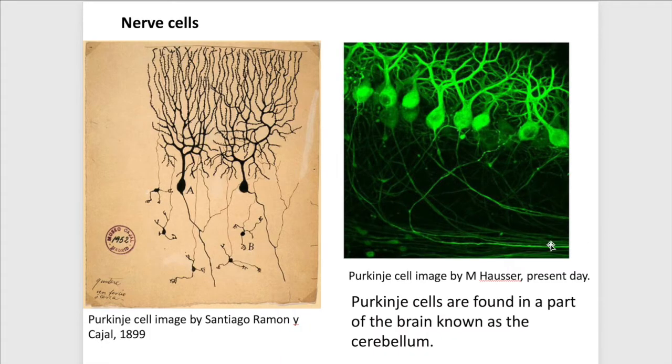Let's look at nerve cells. And nerve cells have one of the most variabilities of shapes. I've got all kinds of dendritic branches here. I've got all kinds of shapes, and they twist and turn. They go throughout the body. These guys can be extremely long. They can go from one end of the body to another here.